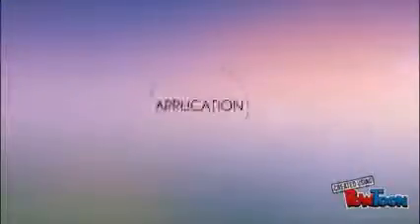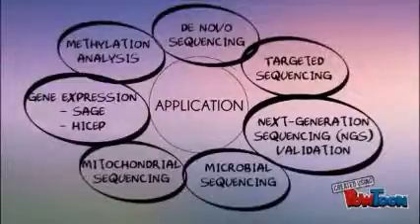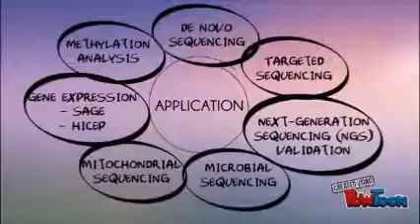Applications using Sanger DNA sequencing include methylation analysis, de novo sequencing, targeted sequencing, next generation sequencing validation, microbial sequencing, mitochondrial sequencing, gene expression such as serial analysis of gene expression, and high coverage gene expression profiling.